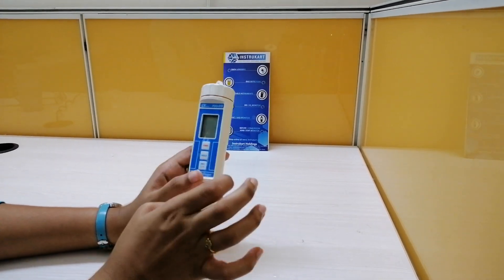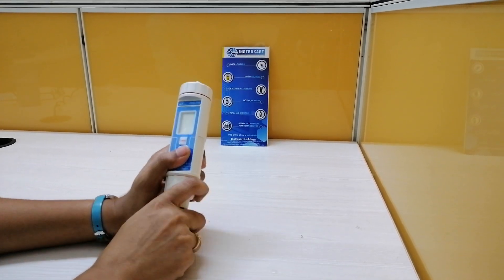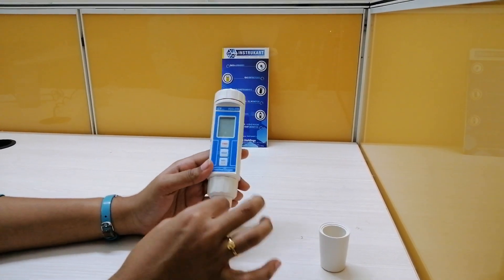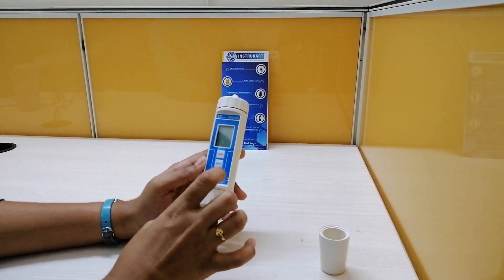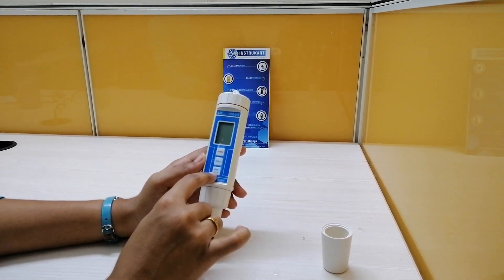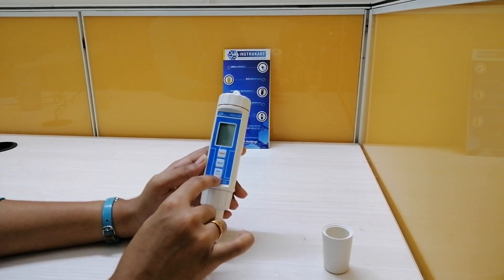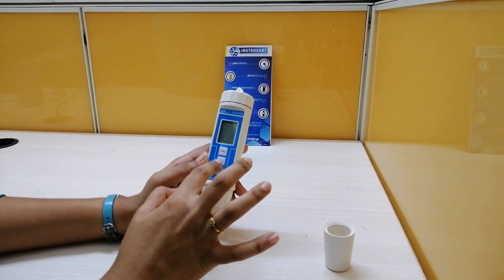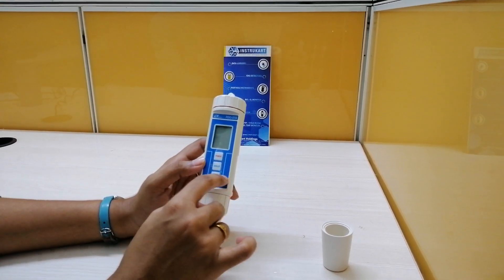Coming to the functionalities of this product: here is the battery compartment, this is a cap, and you will have the probe here — the oxygen probe and dissolved oxygen probe. Here is the power key, hold key, and record key, which also has a unit key with the function of converting degrees centigrade to Fahrenheit. By pressing the two keys at the same time, you can calibrate this device.